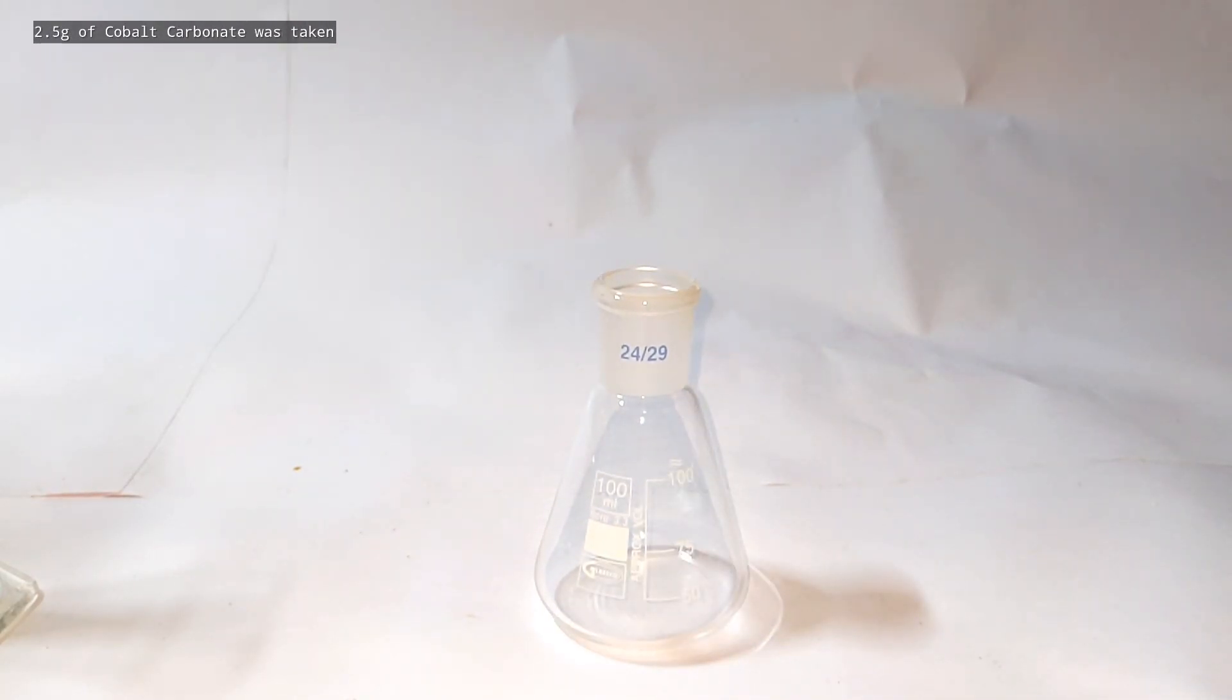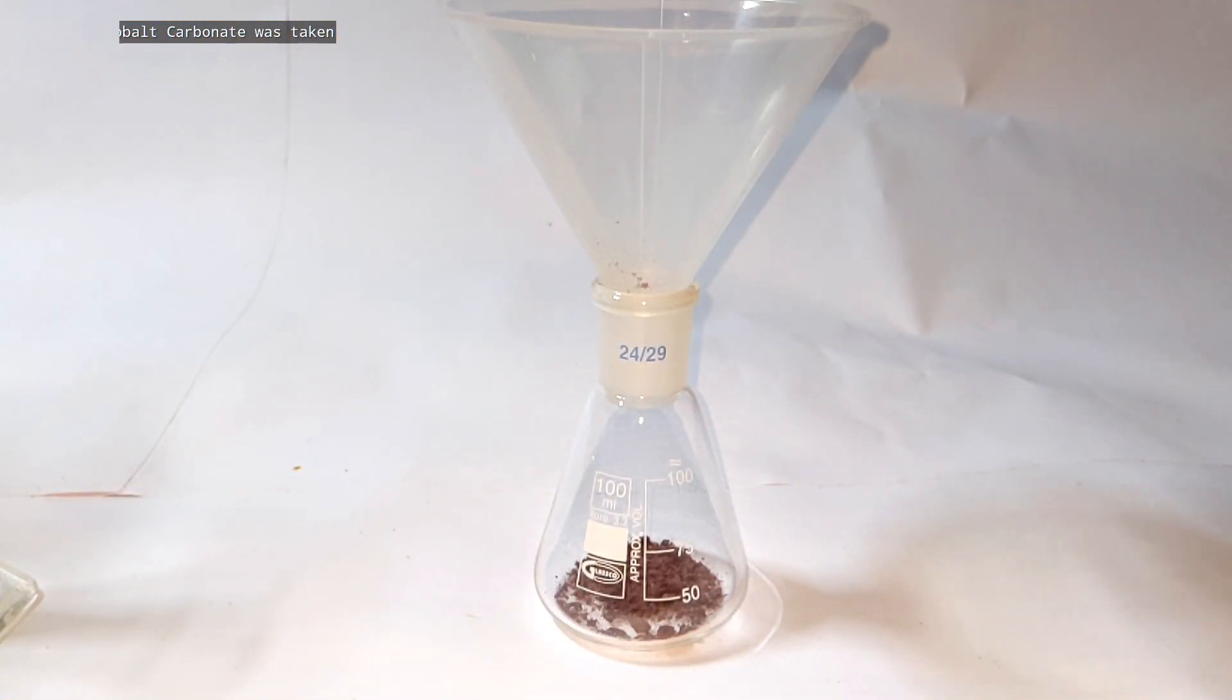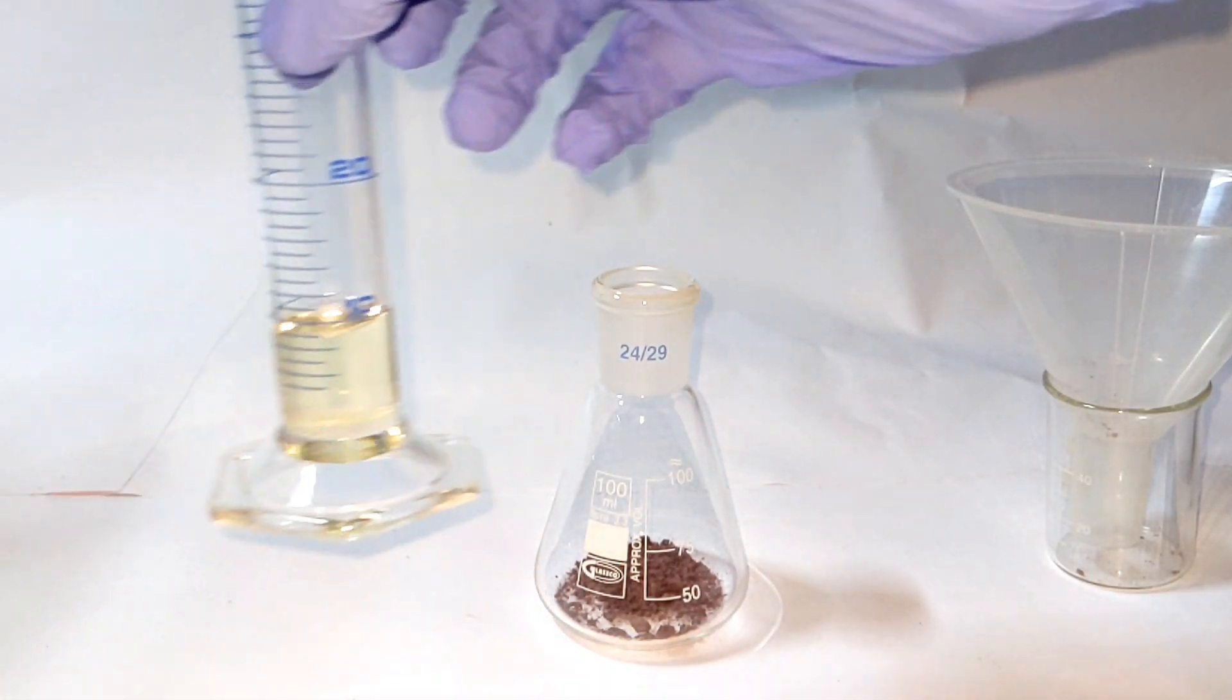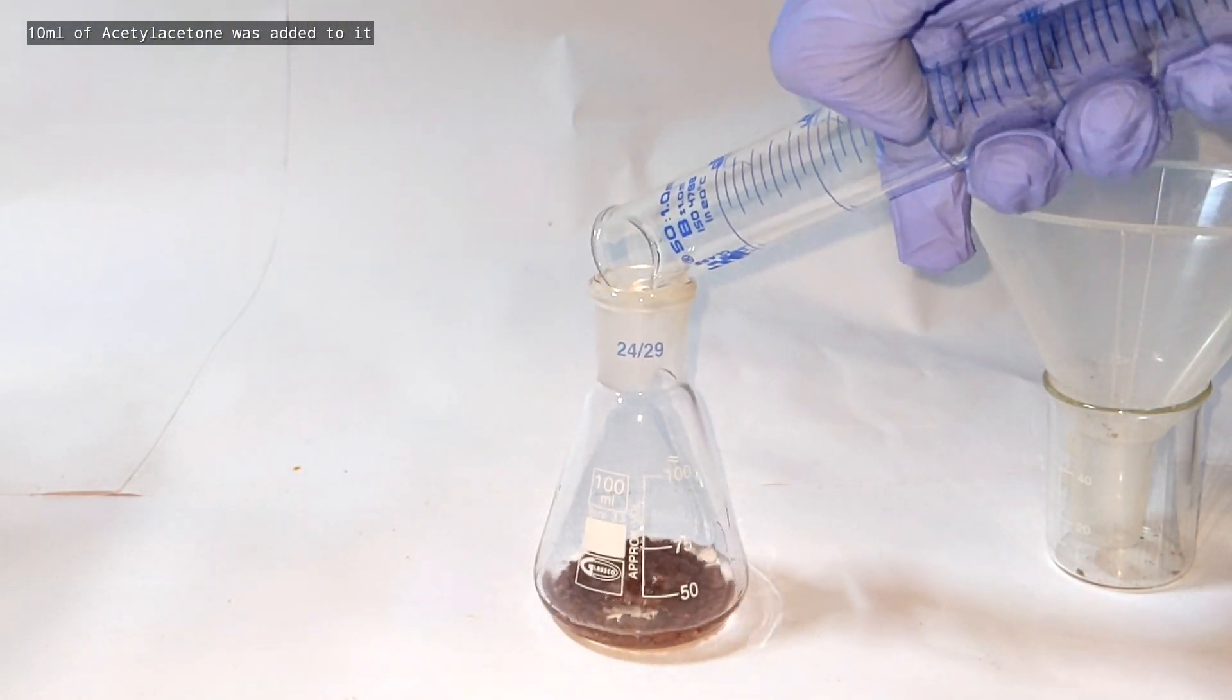A 100 milliliter Erlenmeyer flask was taken and into that was added 2.5 grams of cobalt carbonate, then 10 milliliters of Acetyl-Aceton was added.